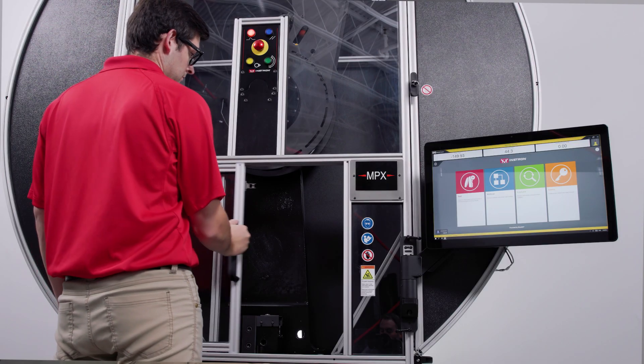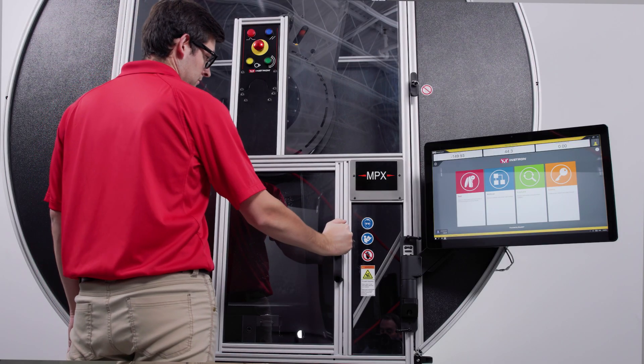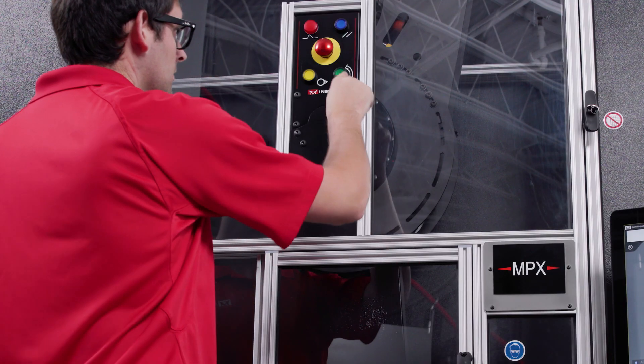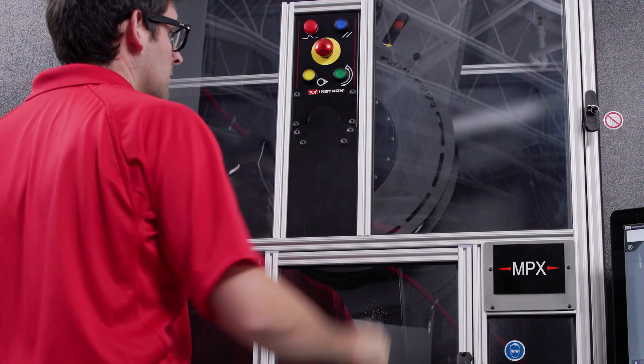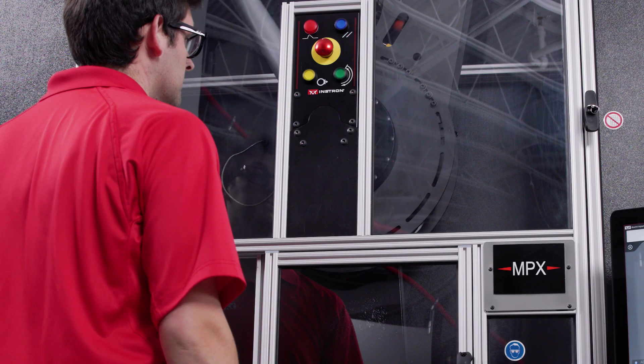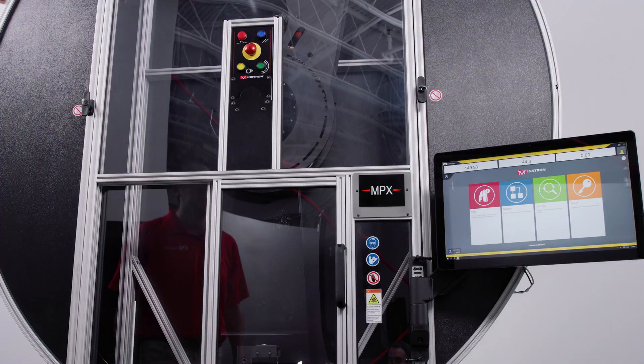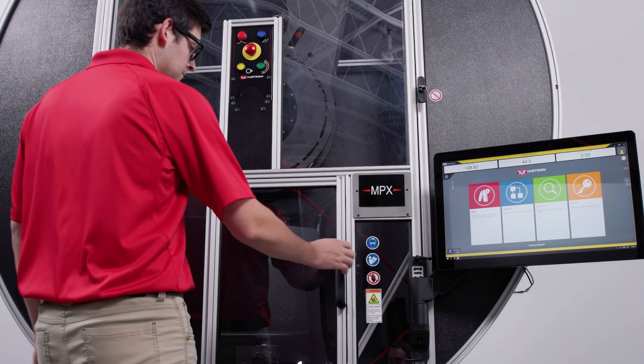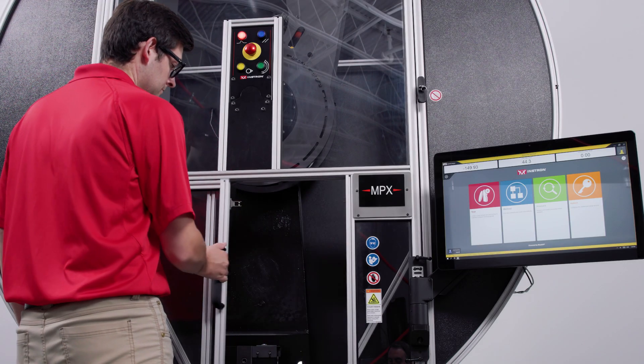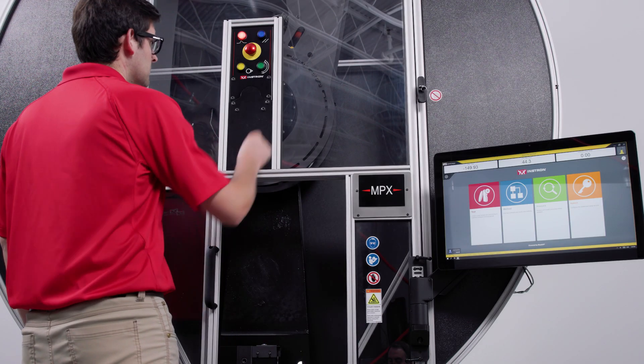The MPX uses an interlocking system to ensure that the testing space cannot be accessed while the hammer is moving. It also prevents the hammer from being released while any of the interlocking doors are open.